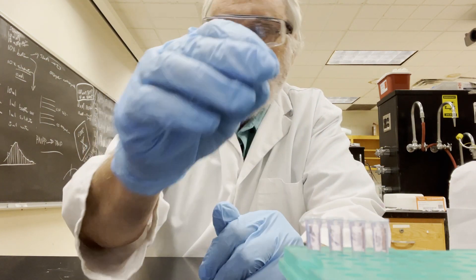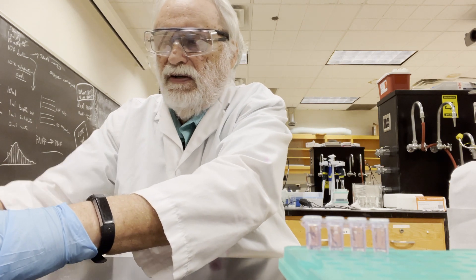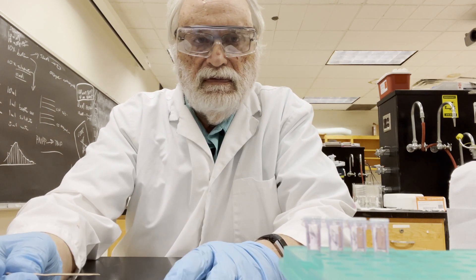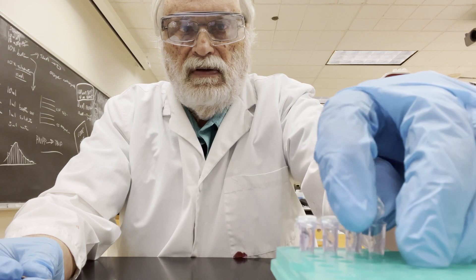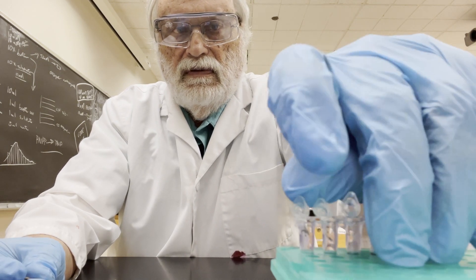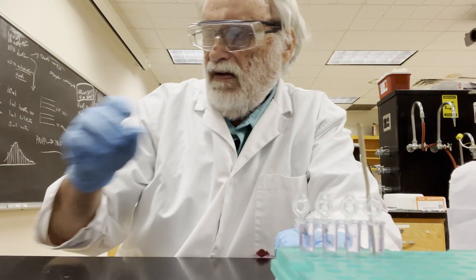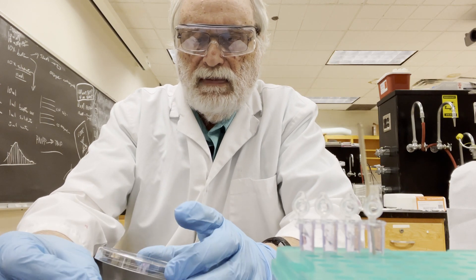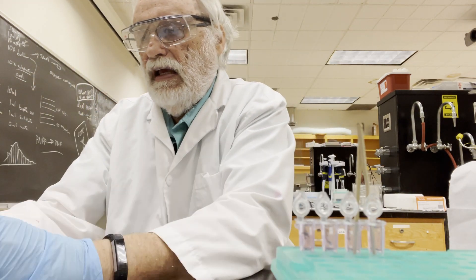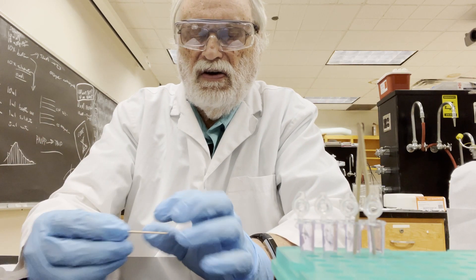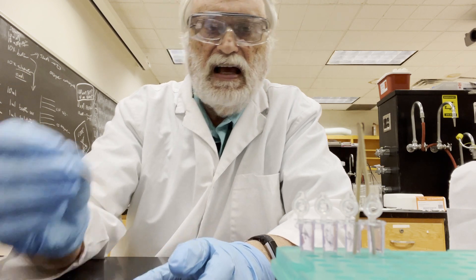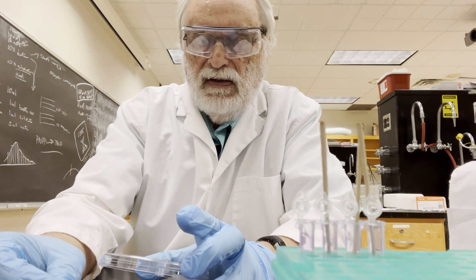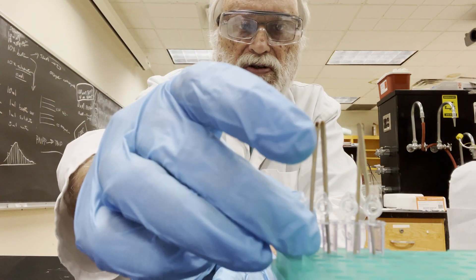We'll go ahead and do the picking right now. I have some sterile toothpicks here. I will pick my first toothpick out. I will touch colony number 1. Now, I've found that a lot of times doing this process, if you're a little bit slow at doing this, the toothpicks can absorb a lot of that solution. So you don't want to dally on this. You don't want to spend too much time on this step. So just go ahead and make sure you have cells at the end of the toothpick and put them in the solution. So here they're in the solution.